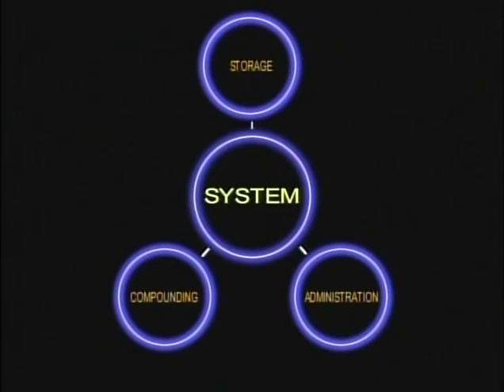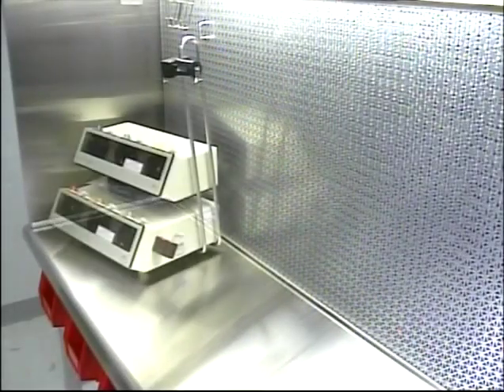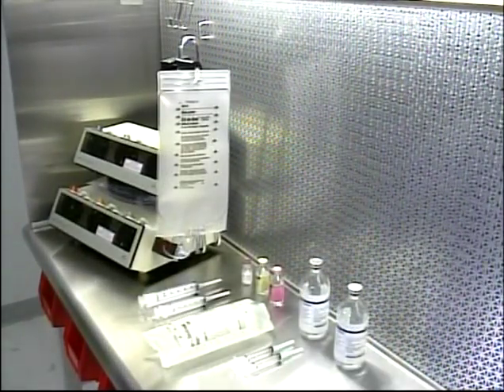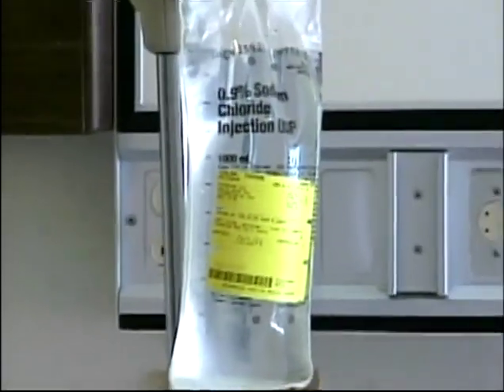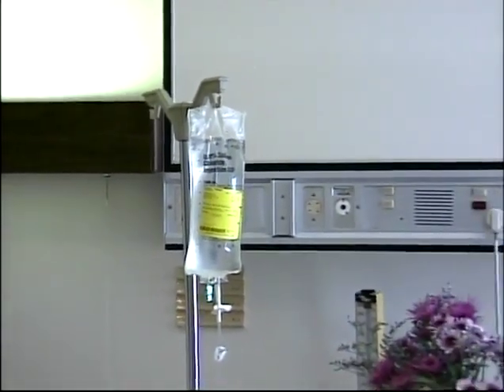In the compounding phase, sterile drugs and components are aseptically combined and made ready for administration to the patient. This must be accomplished without any compromise of the nature and quality of the finished IV admixture by personnel responsible for its compounding and delivery.